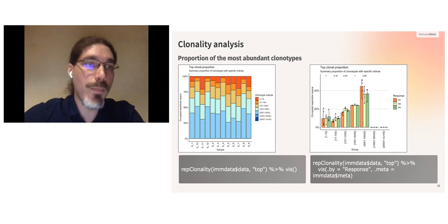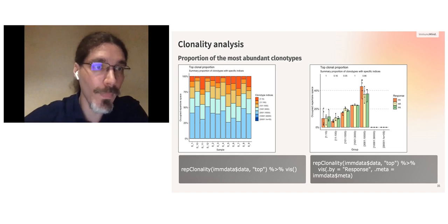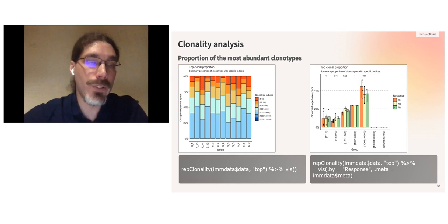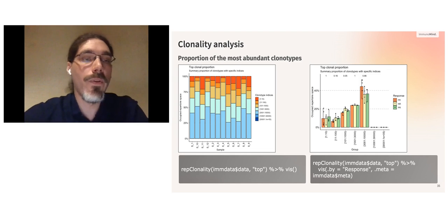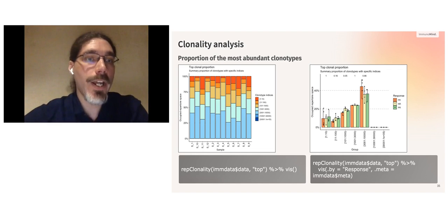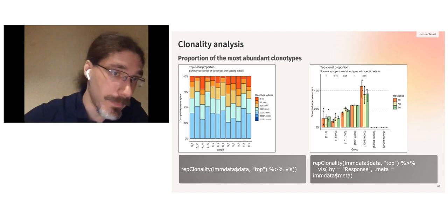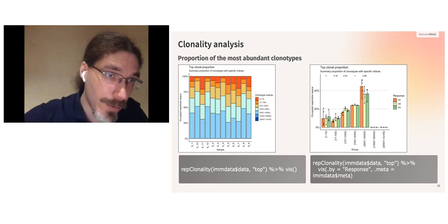Then we just combine the abundance of these clonotypes and plot it on the per-sample chart. If you look at the very first column at the left, for the S1 sample, you can see that the red pool, the summary abundance of the first 10 clonotypes, is around, I don't know, 10%.